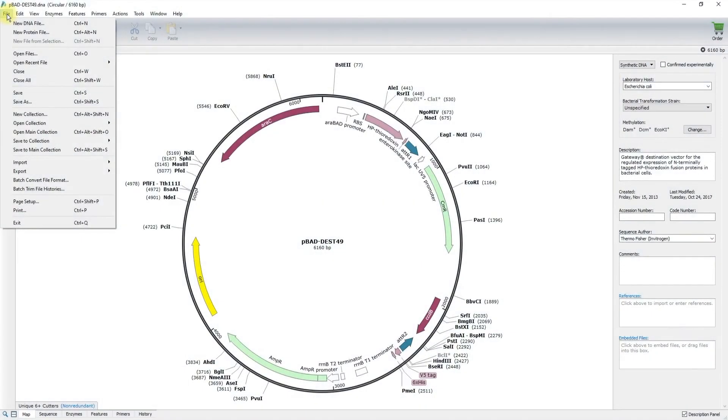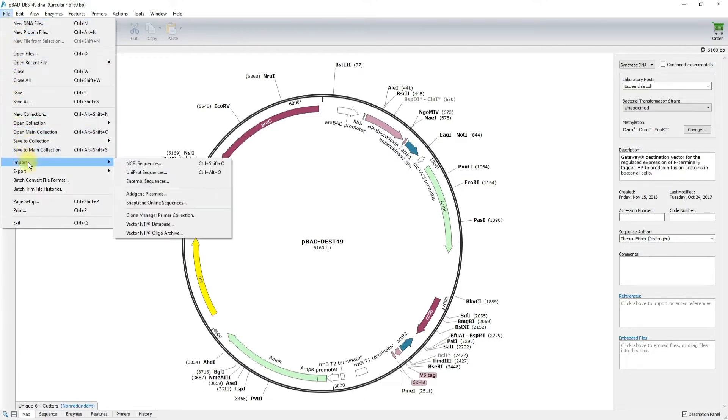The functions for creating DNA files and documenting them are found in the file menu. Your options include creating a new sequence or importing sequences from any number of online databases.